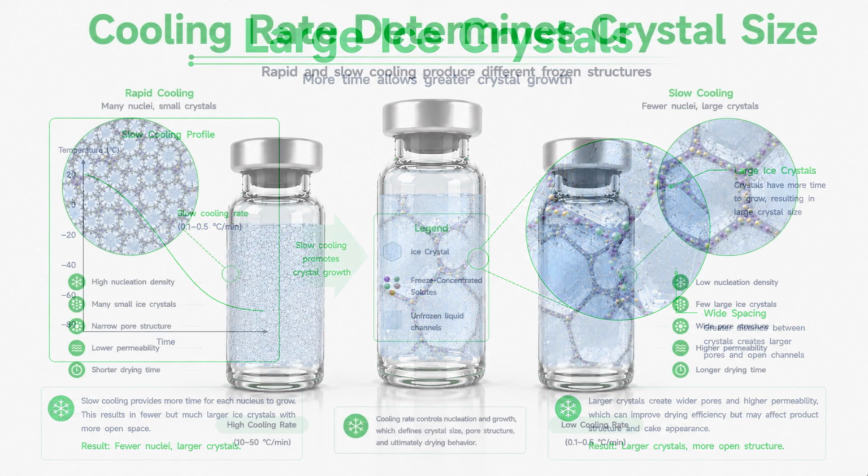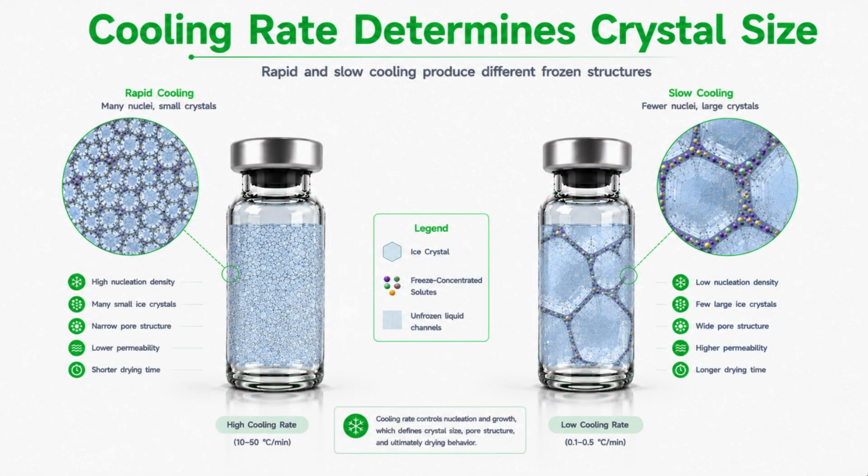Although both products become completely frozen, their internal structures are fundamentally different. That microscopic difference becomes critically important during drying.